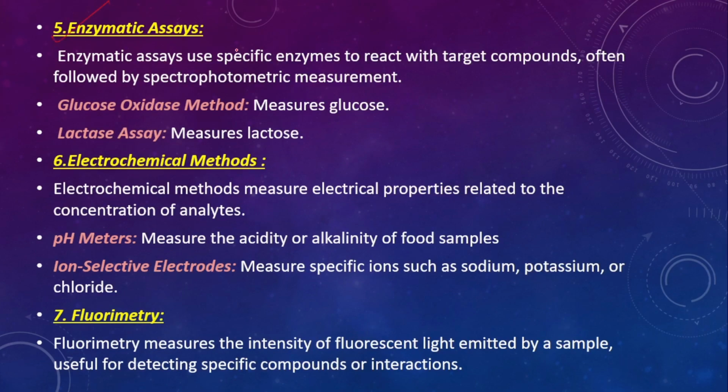Next, coming to the enzymatic assay, which uses specific enzymes to react with the target compounds, and later on it is followed by spectrophotometric measurements. The glucose oxidase method is used to measure glucose.